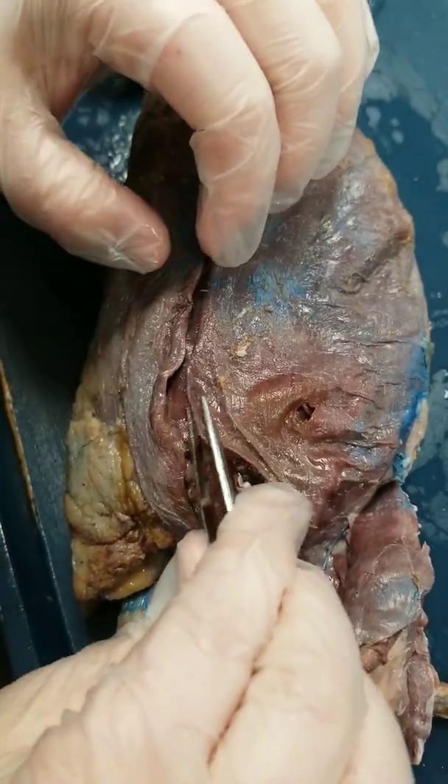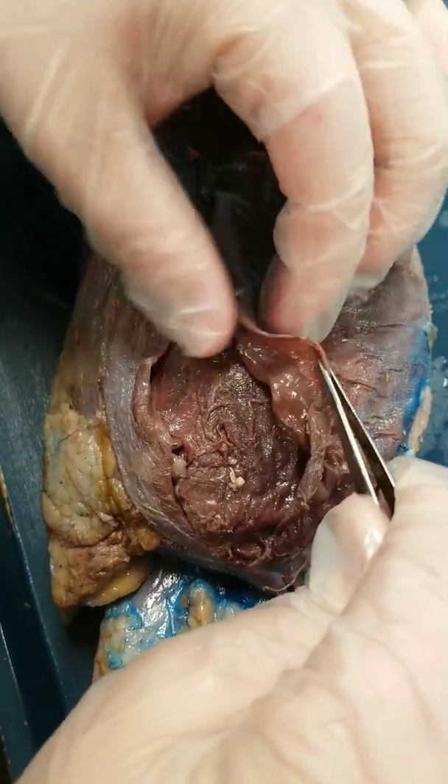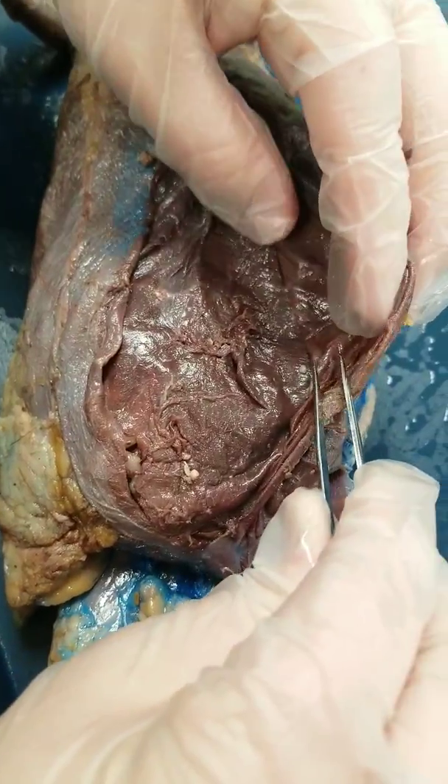By going underneath this edge, you can slowly but surely lift it back. You can see how thin it is.